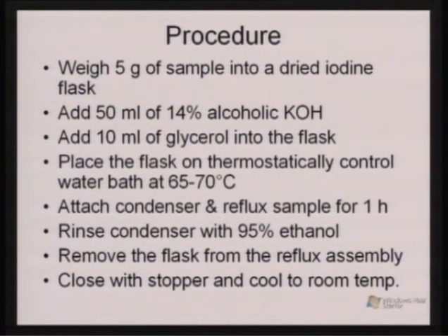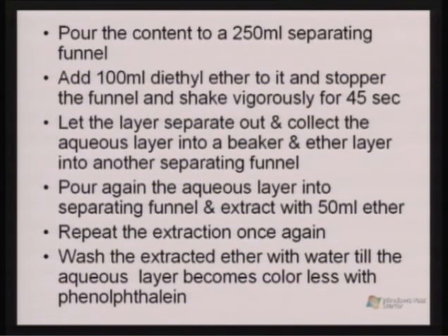After removing from the water bath, you need to cool the sample to room temperature immediately. Pour the content into a 250 ml separating funnel. Add 100 ml diethyl ether to it, stopper the funnel and shake vigorously for 45 seconds. Let the layers separate out and collect the aqueous layer into a beaker and the ether layer into another separating funnel.